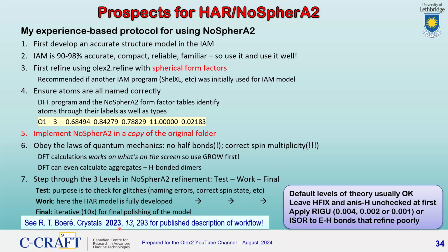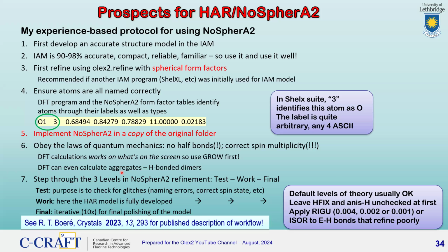This workflow is published in the Crystals paper, because some reviewers asked for it, and we're very pleased to supply that. Basically, this is the series that we go through. One point that did become apparent in our work is that atom labels are really important here.